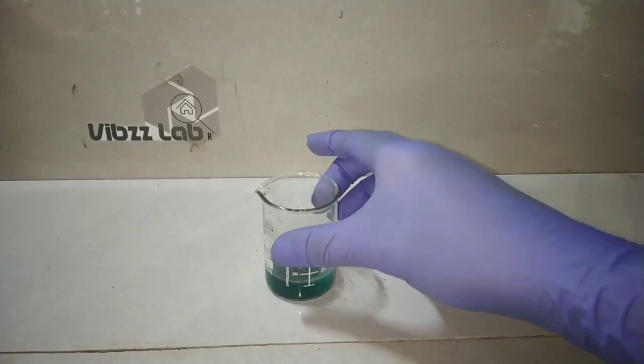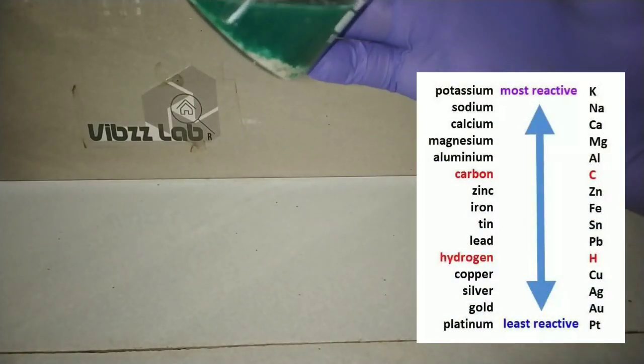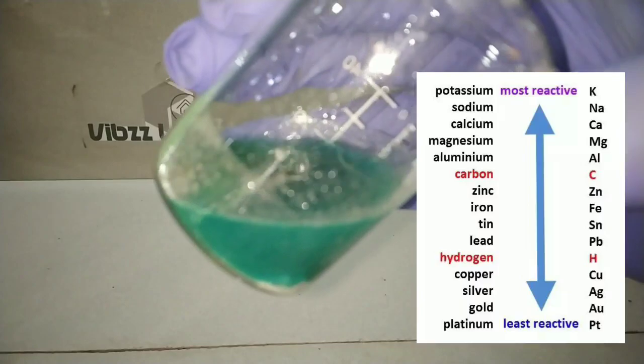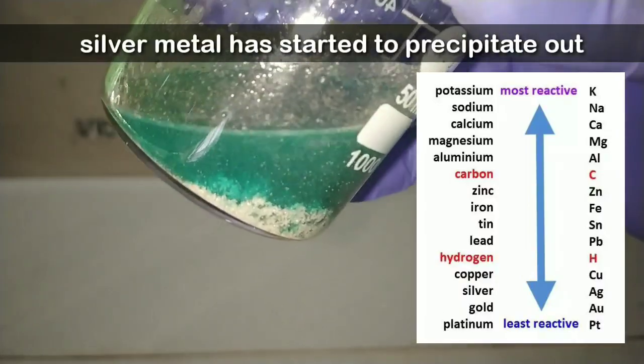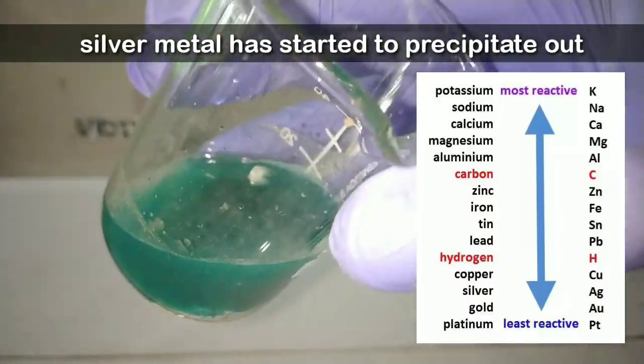So silver gets precipitated out. After about 3 minutes later when I look, I see that the silver precipitate has started to form. You can see the grey white color of silver metal.